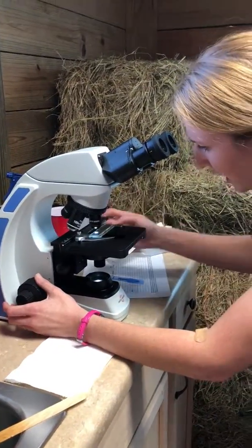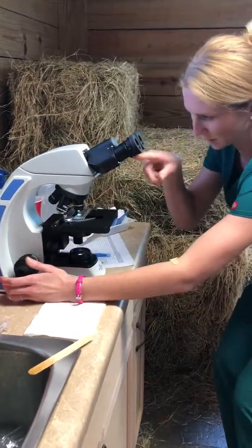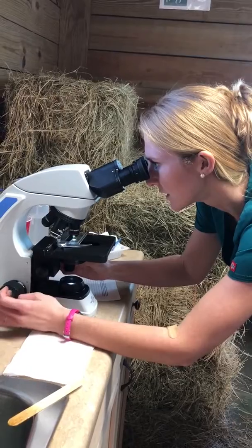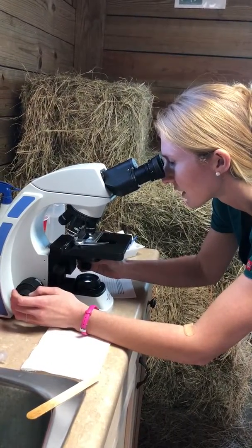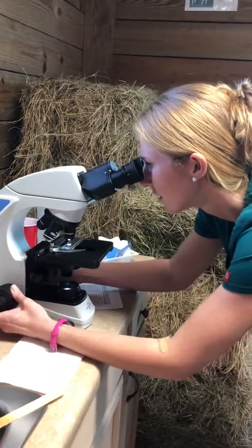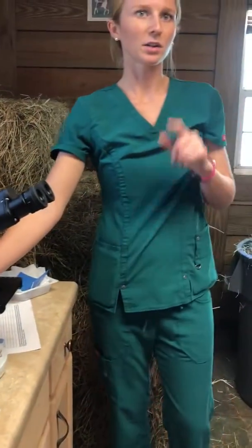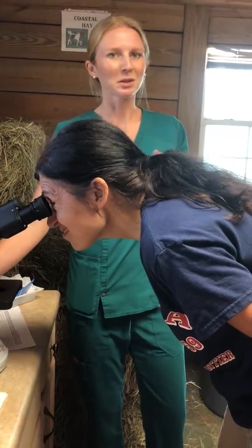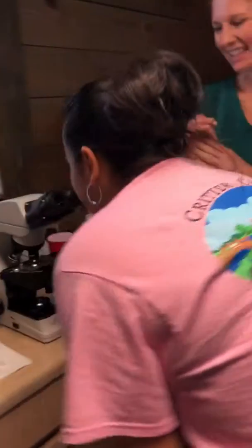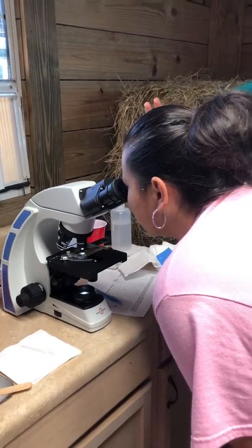Then you start looking through here. You can see where you're at on the slide — get an idea and kind of center it for yourself. Scoot the stage up as high as it goes, then start to use the fine focus to figure out exactly where you are. Right now the blue grid lines are in focus, which may look pretty, but that's not what we want to see. We want to see what's in the sample — from this view we can't, so we'd count zero eggs.